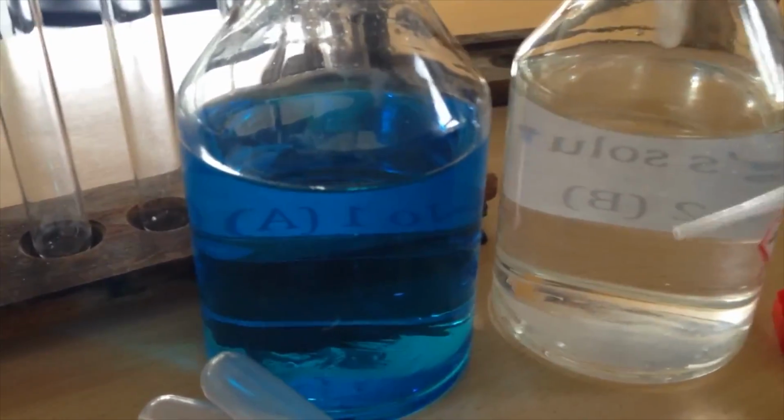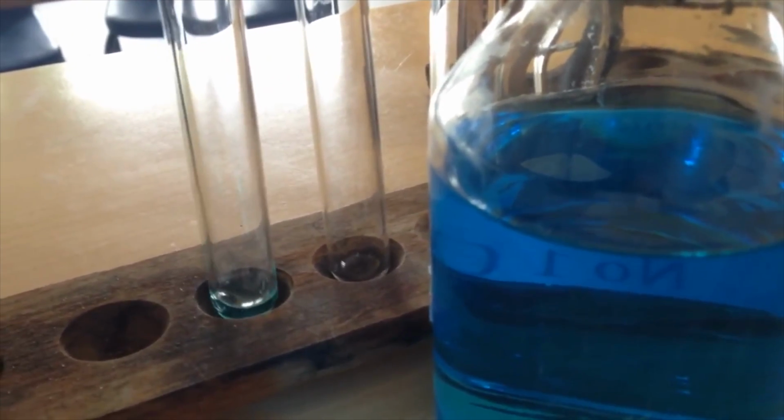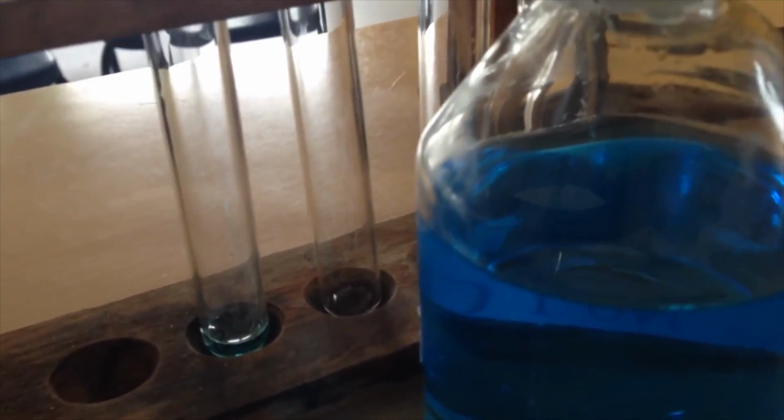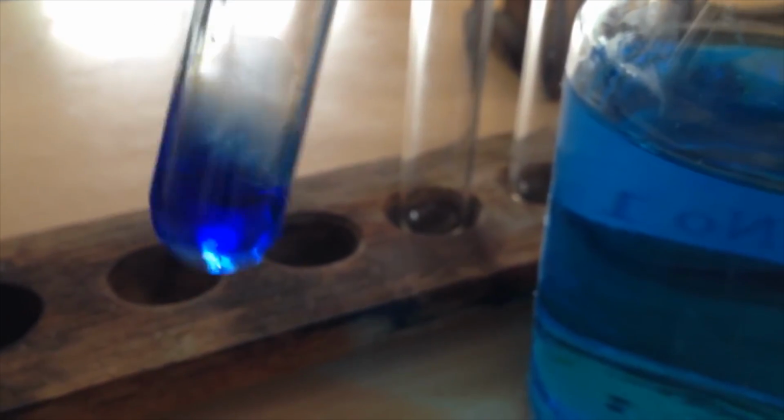Here I have some Fehlings A and some Fehlings B solutions, and I'm just going to mix equal amounts of those to produce our Fehlings test reagent. Obviously you should do it much more accurately than just using little plastic pipettes. And you can see that after I mix it, this is going to be a lovely, lovely dark blue solution.